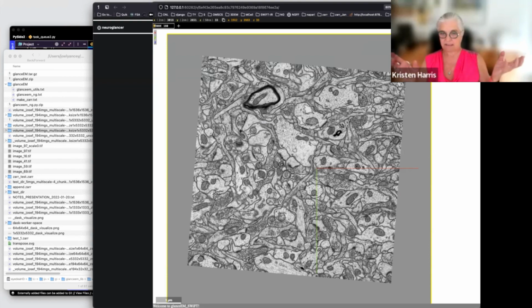And then the blend gives you a full-on blend, and the blend is extremely useful too. When I look at any alignment, I literally turn on the blend and then I page through it with the blend on. So you get to see two adjacent sections and you instantly see where one comes out. So that tool is extraordinarily useful in testing alignment. I mean, obviously, you're putting in automatic tools to tell us how good the alignment is.